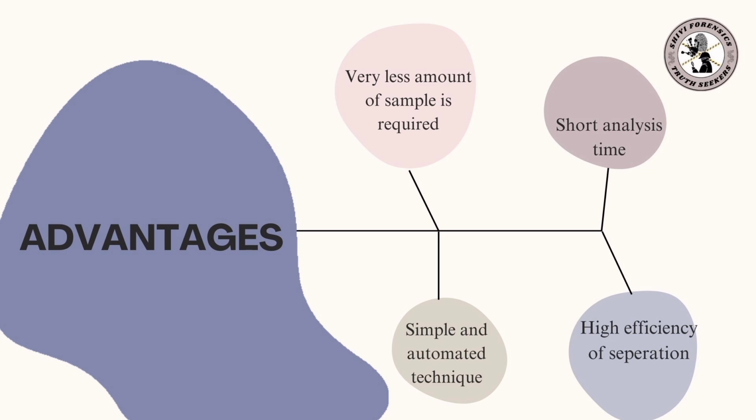So next are the advantages. First, it requires a very small amount of sample. Second, it takes a short time for the analysis of the sample. Third, it is a simple and automated technique. Fourth, high efficiency of separation takes place in this technique.